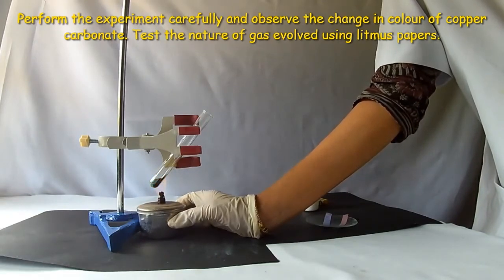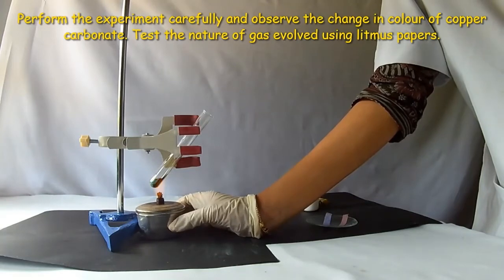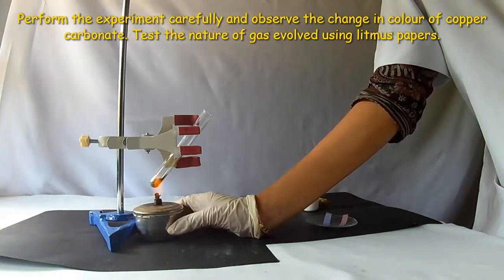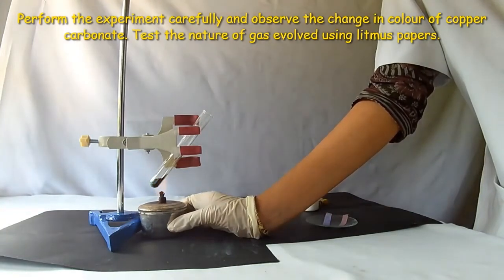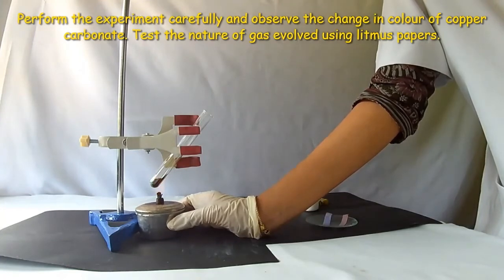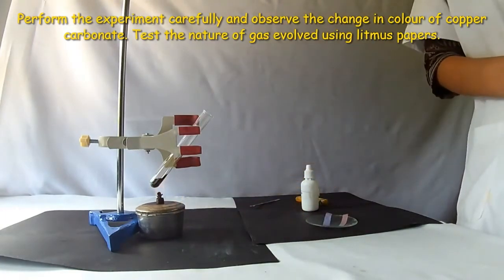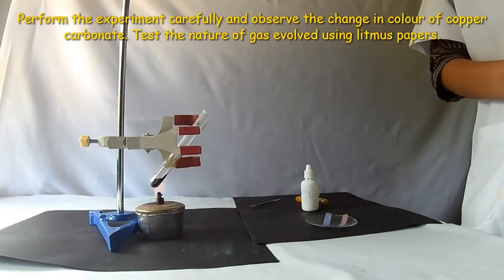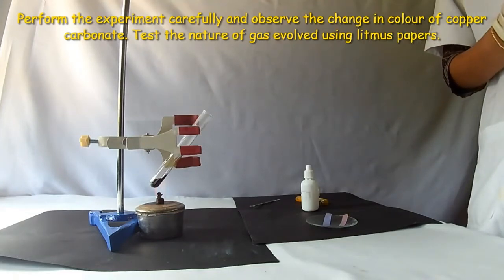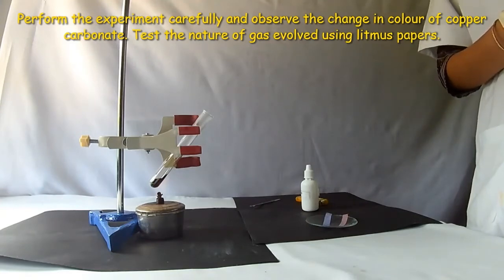See, the salt color is changing from green to black. The green color salt changes its color to black. Copper carbonate which is a green color salt decomposes forming copper oxide and carbon dioxide.